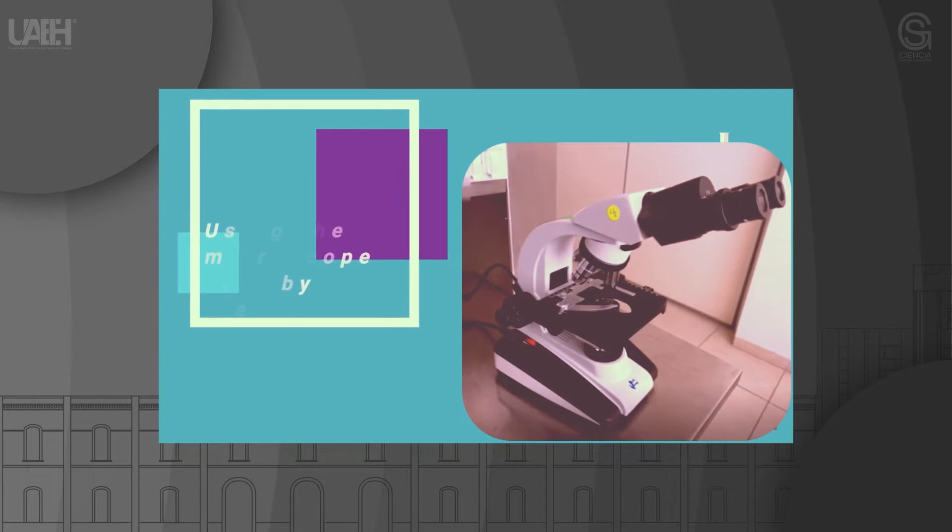Using the microscope step by step. If you already know and have been able to identify all the parts of the microscope, you can follow these steps to carry out an observation.